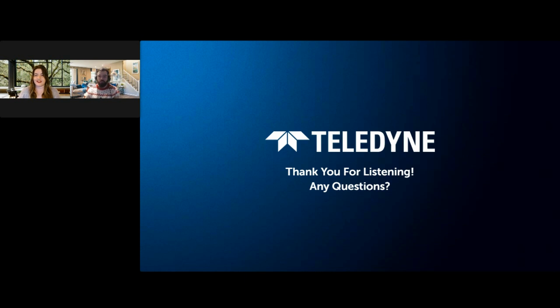Great, thank you. We have time for just one more question today. That question asks, what are the benefits of programmable scan mode for light sheet? Yeah, we went over this in the presentation, but the main benefit here is flexibility. The whole point is that you have the power of the hardware and you need the flexibility in the software. The cameras are very compatible with lots of different operating systems, lots of different imaging programs, acquisition software, and this kind of thing.